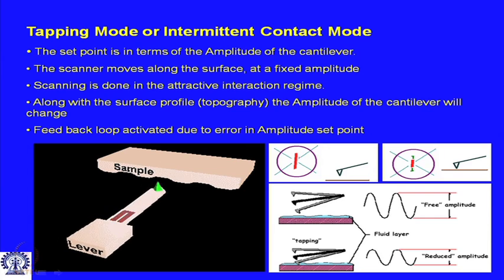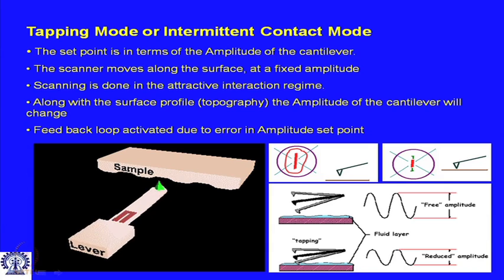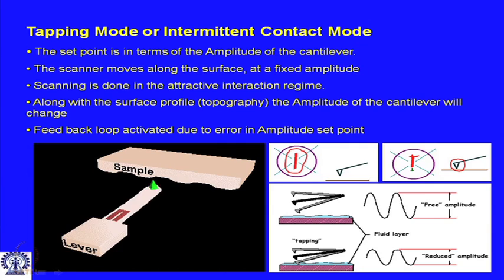Okay, so here you see that this is the movement of the laser path corresponding to the free amplitude of oscillation, and this is far away from the surface. Since the surface is now close, it gets truncated. I would rectify this figure. So, on one side it gets truncated, and this is the error that gets generated.